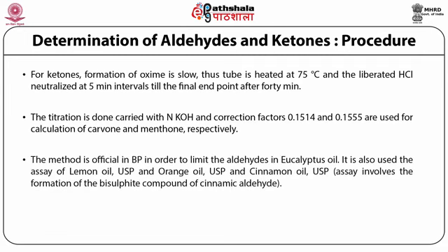This method is official in BP in order to limit the aldehydes in eucalyptus oil. It is also used in the assay of lemon oil USP, orange oil USP and cinnamon oil USP.